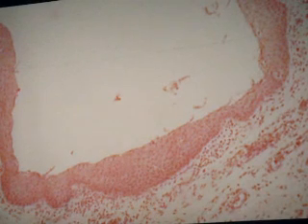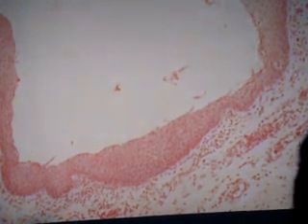Classify pointed tissue, be specific. Stratified squamous epithelium, wet type or non-keratinizing. Would you be able to say that it's the esophagus or the vagina? Actually, ako hindi ko masasabi. Okay? Actually, mahirap. Kasi remember ang esophagus mo, underneath is a layer of loose connective tissue. Pero mukhang ito, loose connective tissue ito.